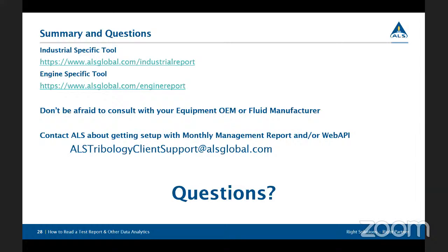Jerome also asked, what would be the most efficient way to submit multiples of samples? Many times we have 20 plus at a time to do, and filling out the paperwork by hand is time consuming. So I think I'm going to have to do a webinar based on sample submission on Webtrieve.